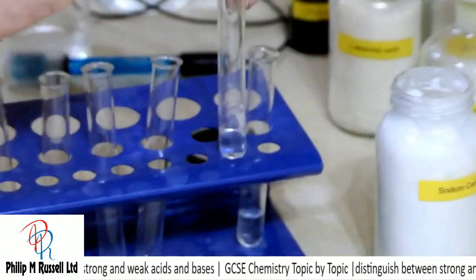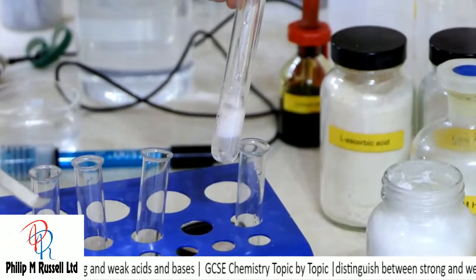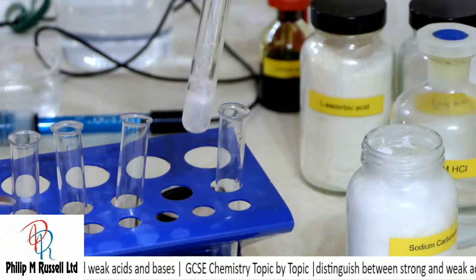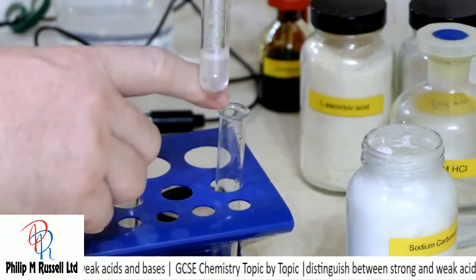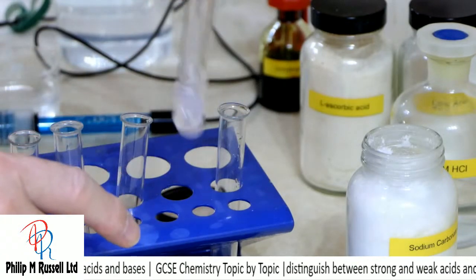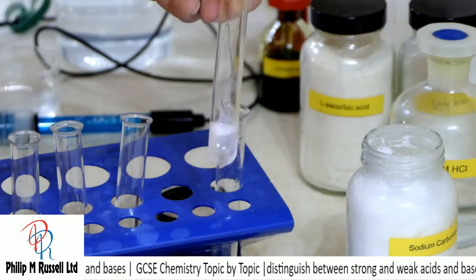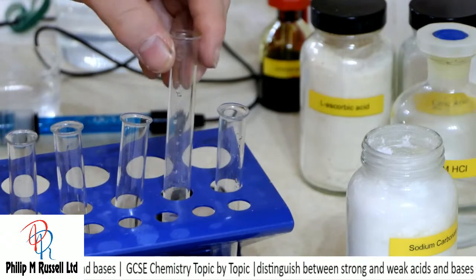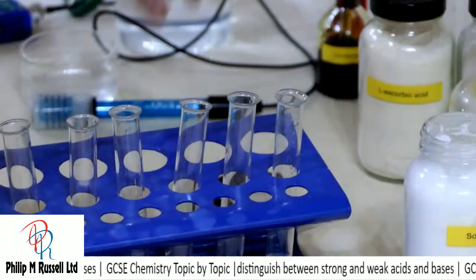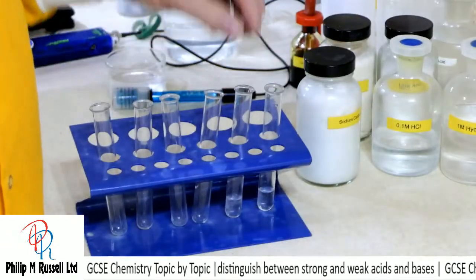Let's try again. A lot more this time. And that is reacting really nicely. If I put my finger here, I can feel it's got a little warmer. Not very. Just making sure all the sodium carbonate there has reacted. So not much difference then between our first acid, nitric acid, and the sulfuric acid.